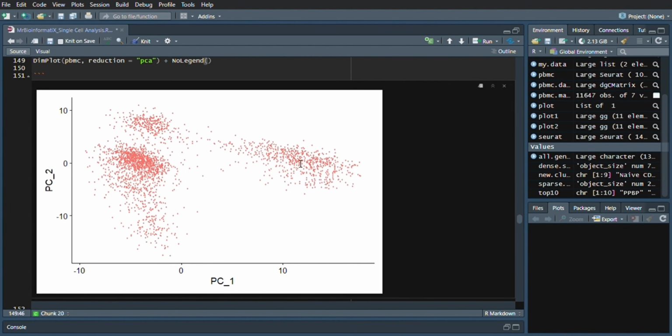And for here, this cluster is positioned around 12 on PC1 and the same 0, or like 1 or 2, for PC2. This cluster represents cells with higher values on PC1. These cells have a different set of gene expression features compared to those in group 1, leading them to be distinctly separated in this part of the plot.